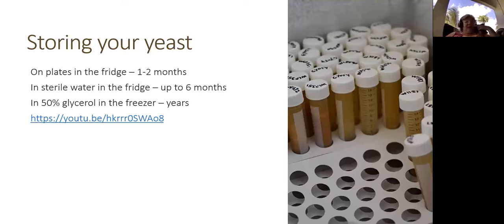If you are like me and I brew generally at least monthly, I go through a lot of yeast, and I really get annoyed having to spend $5-10 each time for yeast, so I tend to produce my own stocks. You can store the agar plates in the fridge, and those are good for a couple of months, after which the viability of your yeast drops and you really need to reculture again in order to consider them good.